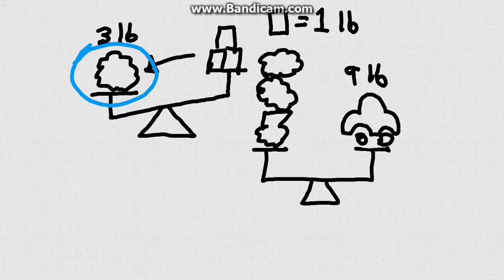In this case, we used an acid over here. We knew the concentration of this acid, so we used that to titrate. And all titration means is to just kind of work them until you reach whatever goal you're trying to reach, or to mix them until you reach this goal. So we mixed an acid of known concentration with a base of unknown concentration. So I'm just going to label that as base.